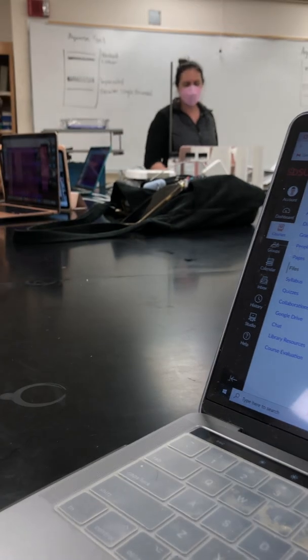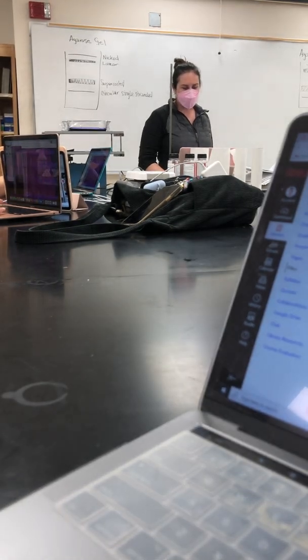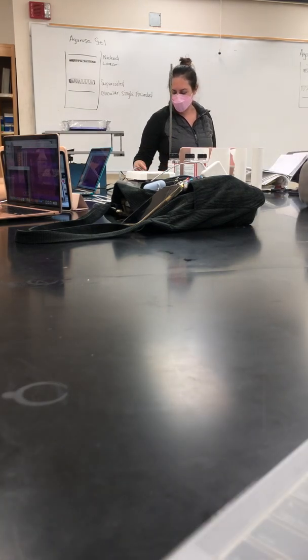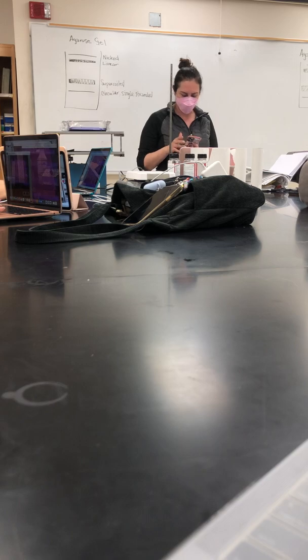Gel. So take a look on the first agarose gel. You kind of see this, like we're talking, kind of see this. Hold on one second.